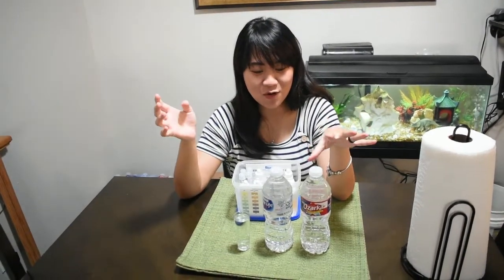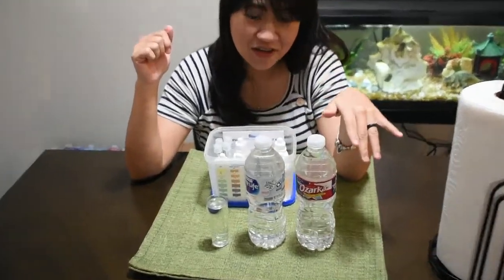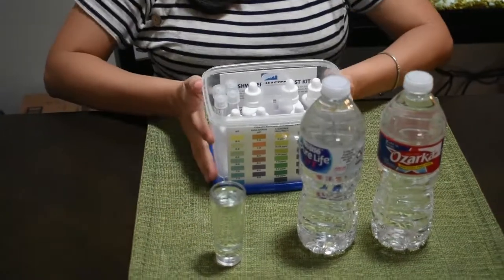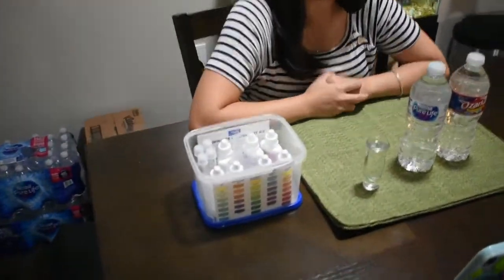Today I'm doing a vlog different than any of my other vlogs because I want to do the water test. Maybe you guys don't know about that, so I'm going to test my water, the water I usually drink, and this is tap water. And I have the testing kit. So why do I do this?